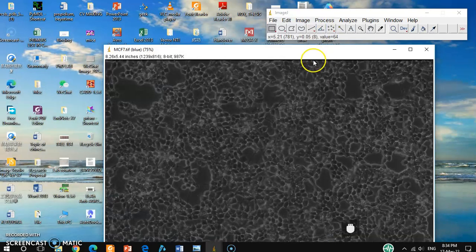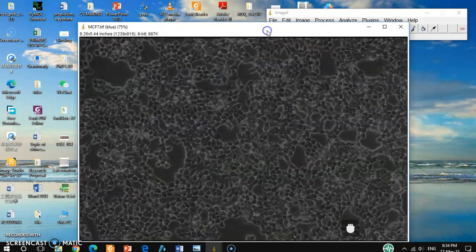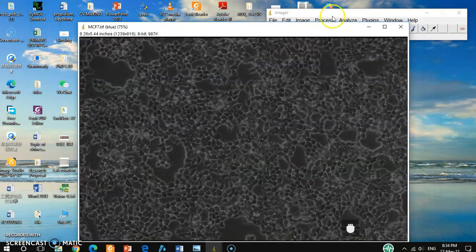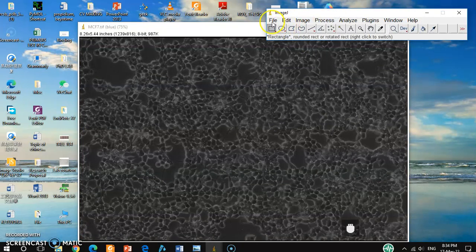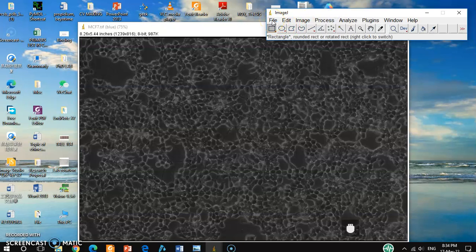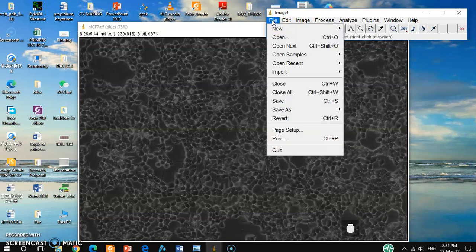And from here you can save it as a TIF image.